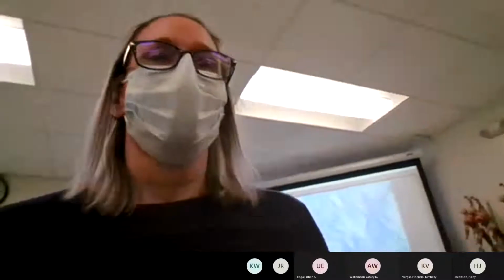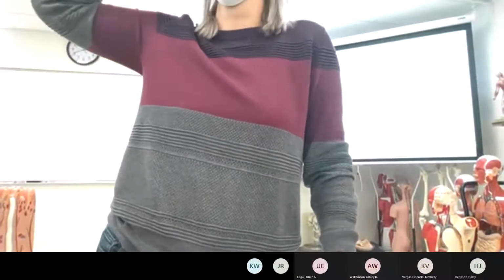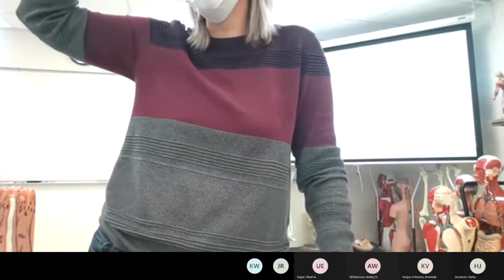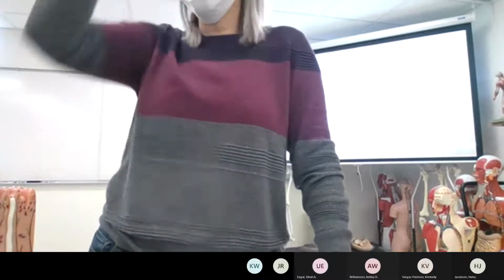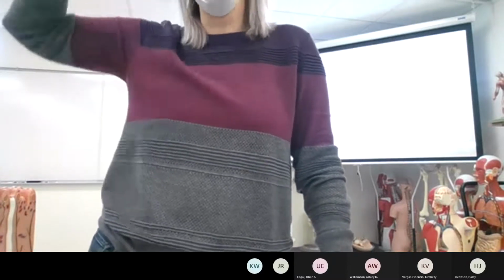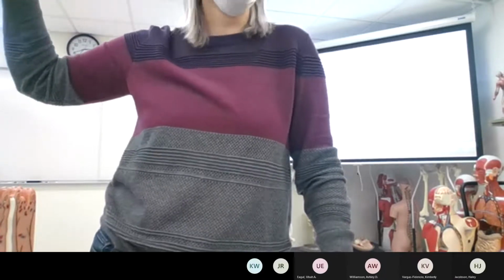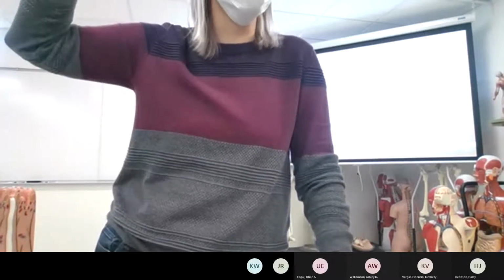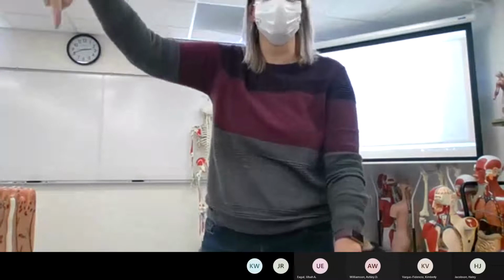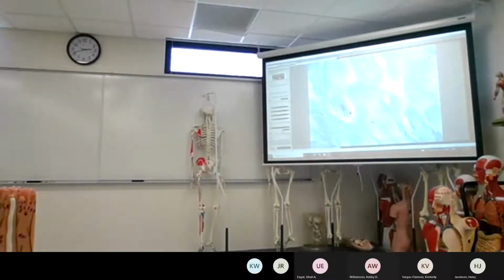Okay. So we've looked at 3 different types of cartilage. Usually the presence of the protein is going to be one of the clues that it's not hyaline. If those proteins look to be in the matrix, then read the question for the clue. If it says this tissue is found in the meniscus or in your vertebral discs, you would then be looking at it going, this has got to be fibrous cartilage.